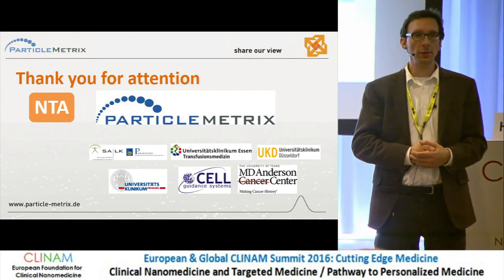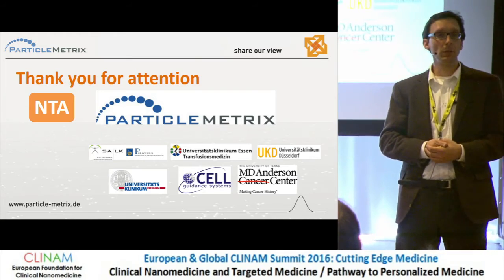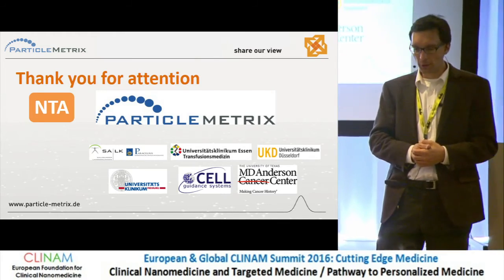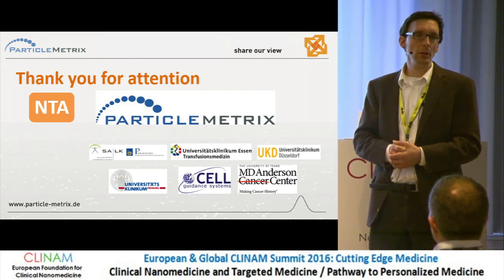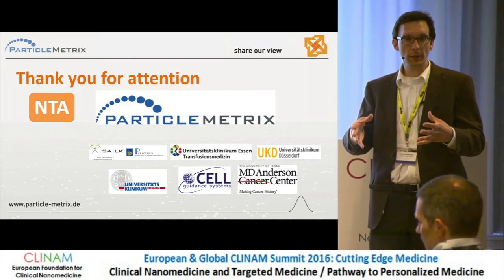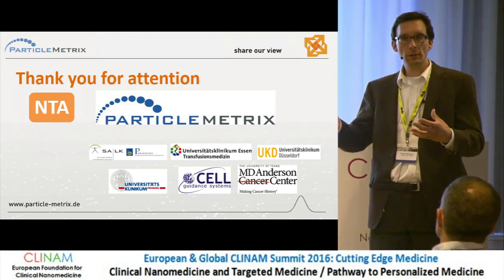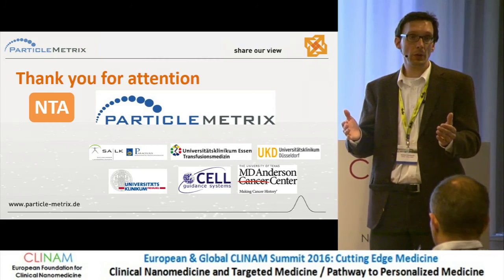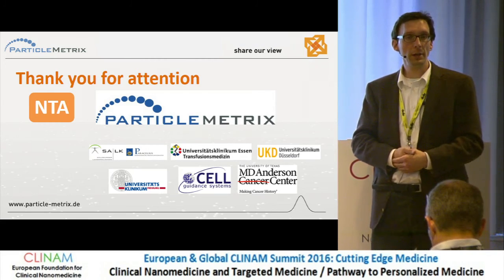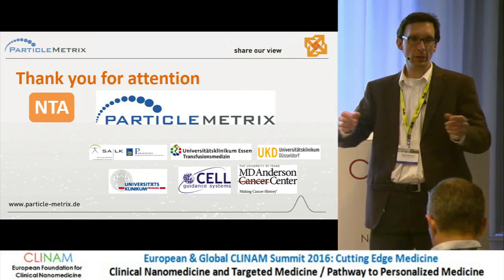It's the hydrodynamic diameter, because we are in the liquid, and we see basically the differences from electron microscope and particles, let's say from gold, this is very typical. If you measure gold in a liquid, in a medium, mostly it has a little bit larger diameter, and the concept of hydrodynamic diameter in our experience is of more effect in the range below 100 nanometer. As soon as you have larger particles, depending of course also on the coating, but definitely it's the hydrodynamic diameter that we are measuring. Yeah, because in nanomedicine we can use very big polymers to stabilize the particles. And so then it has effect also depending on the length, of course.